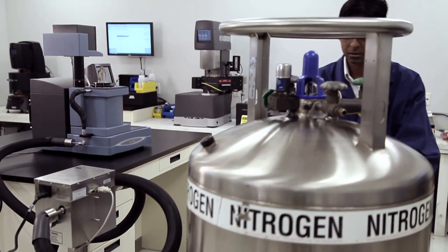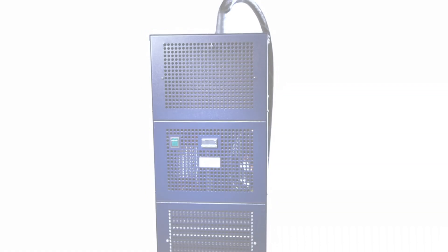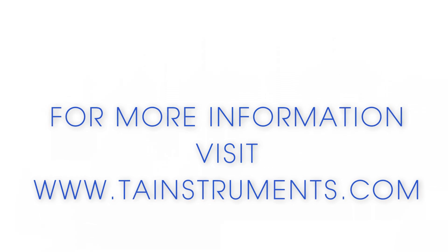For a convenient alternative to liquid nitrogen cooling, look no further than the ACS3 air chiller system from TA Instruments.